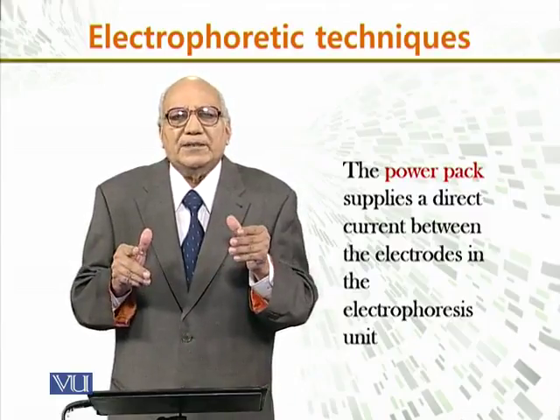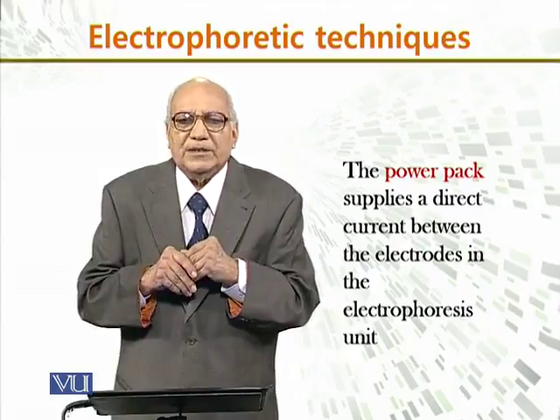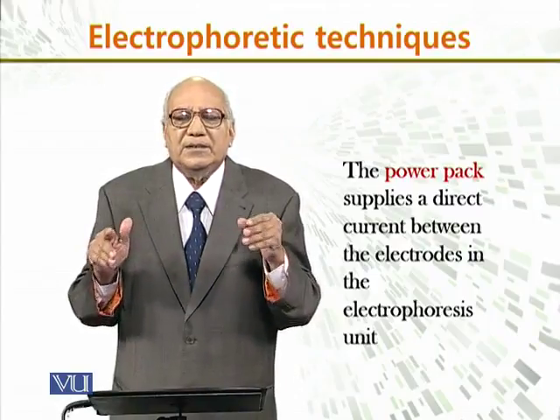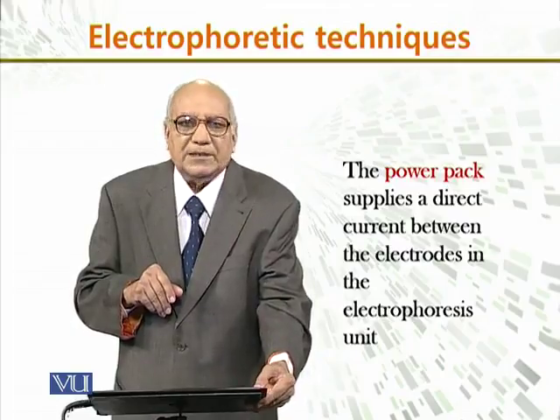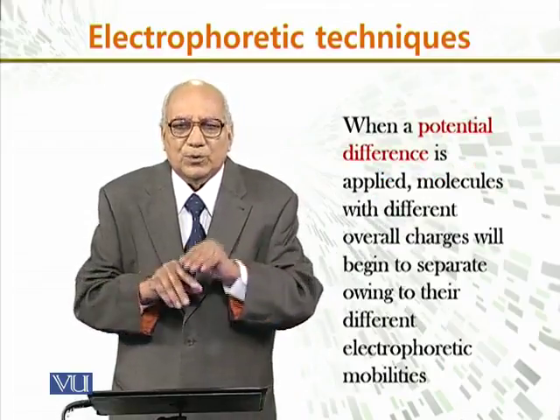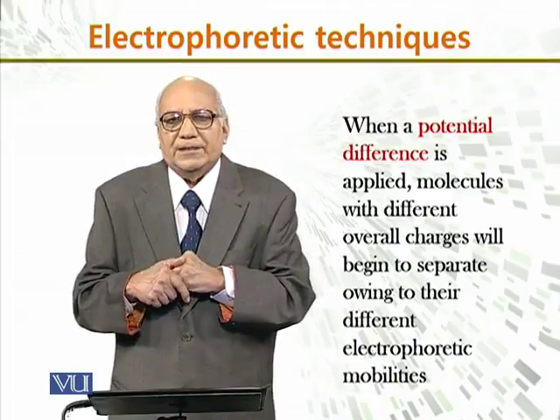The power pack supplies a direct current between the electrodes in the electrophoresis unit, and the particles move under this electrical field.